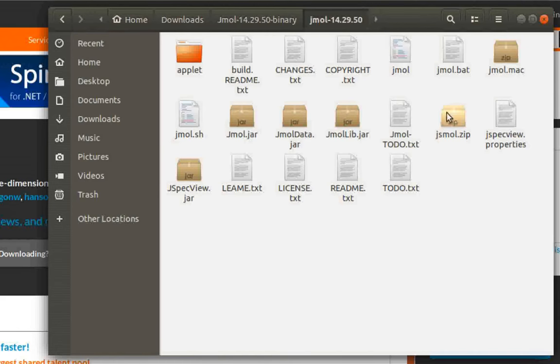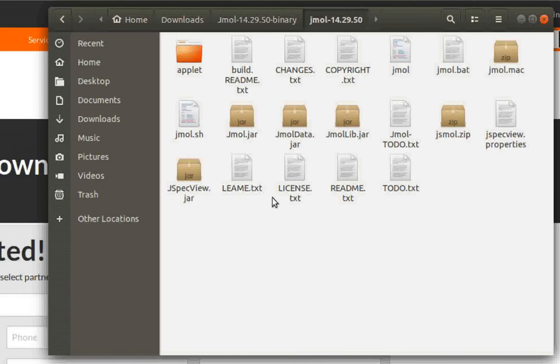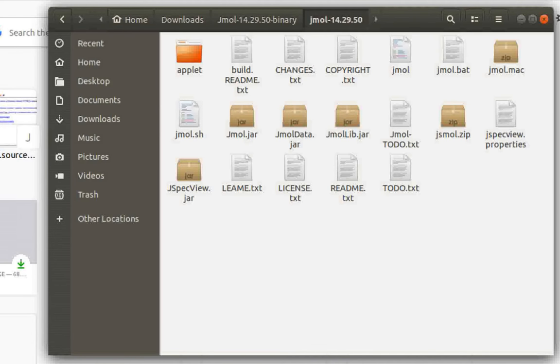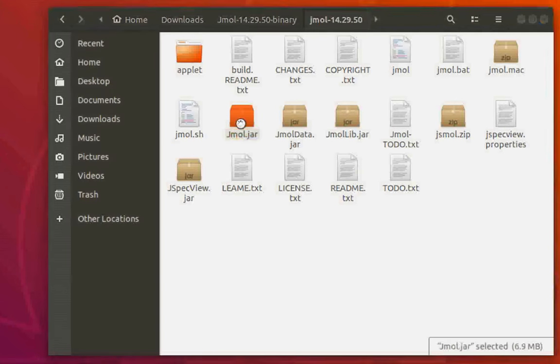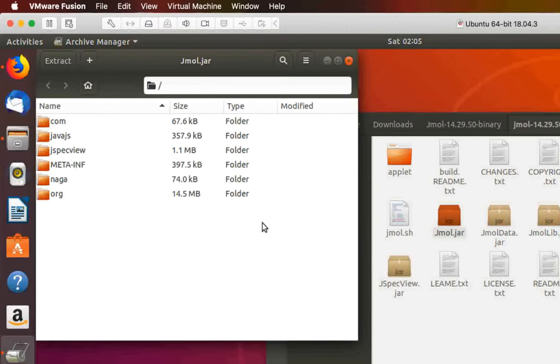If you go ahead and open it, you'll notice it has a lot of files. The most important file is jmol.jar - this is the application or executable file. But if you double-click on it and don't have Java installed, it just won't work and you'll see the contents within this executable file.